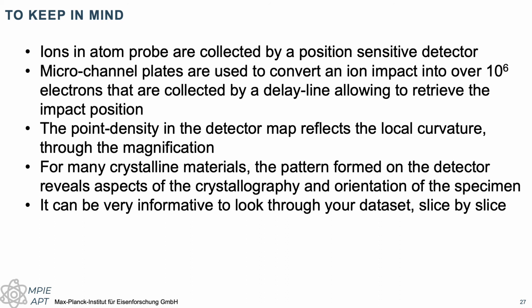And it can sometimes be really quite informative when you wanted to go from one grain to another. You're looking at grain boundary analysis, for example, or interfaces. Then by looking slice by slice, you might be able to spot what is happening at what point in time during your analysis. On this, I leave you, and hopefully you'll find this of interest.